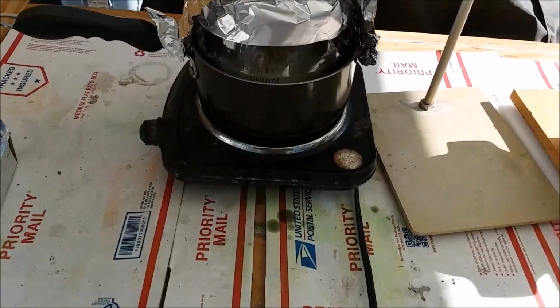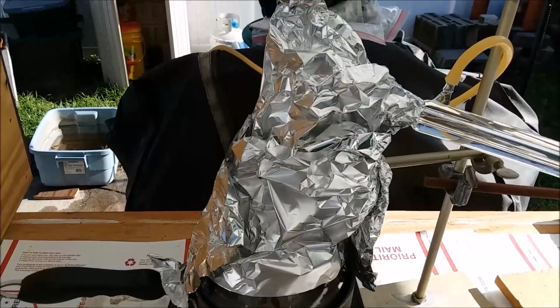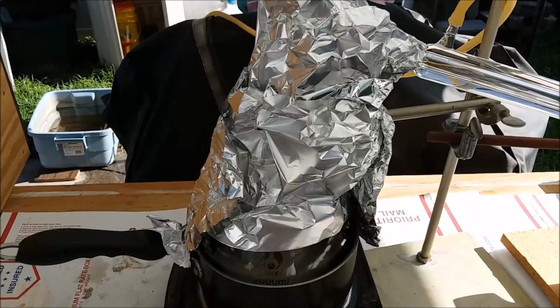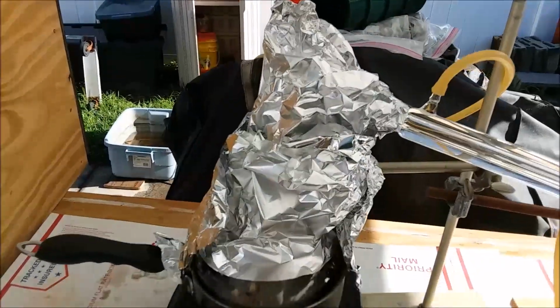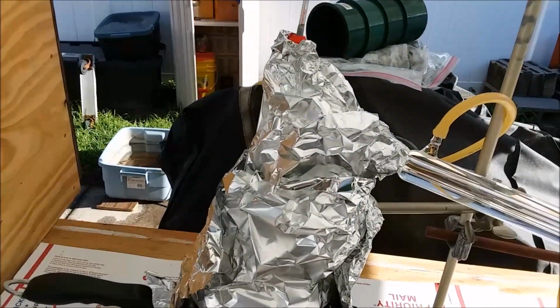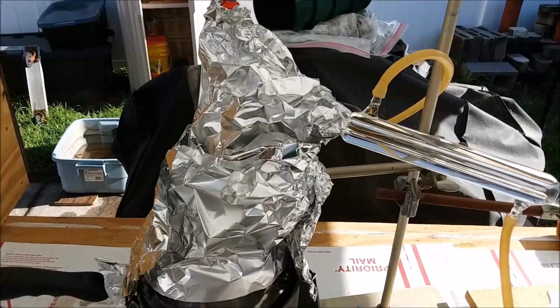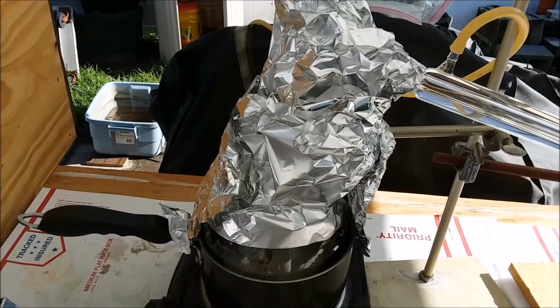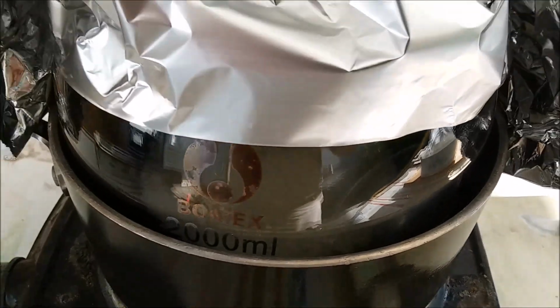Okay, so I'll show you this as it's proceeding. It's been a few minutes. Things are starting to heat up. I have insulated the boiling flask and the glassware immediately before the condenser, just to try and drive more of the vapors into the condenser, because I tend to get a lot of refluxing in the top of the flask and in the glassware up here, and it just seems to take forever for the vapors to actually get over here and condense. So I've insulated it all, so hopefully there'll be less condensation over there. Try and keep as much heat in as possible. Left myself a little window so I can watch her boil over. It's not really showing up on the camera, but I can see in there.